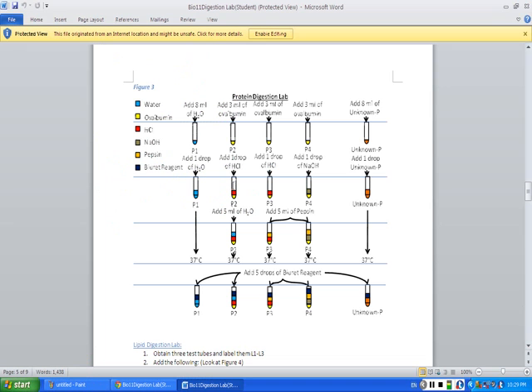Alright, here we added ovalbumin, which is found in egg whites. It's basically egg white protein. And of course, I just mentioned it, but egg whites have a lot of protein in them. And this ovalbumin, we added some HCl with it, and then added some water with it too.